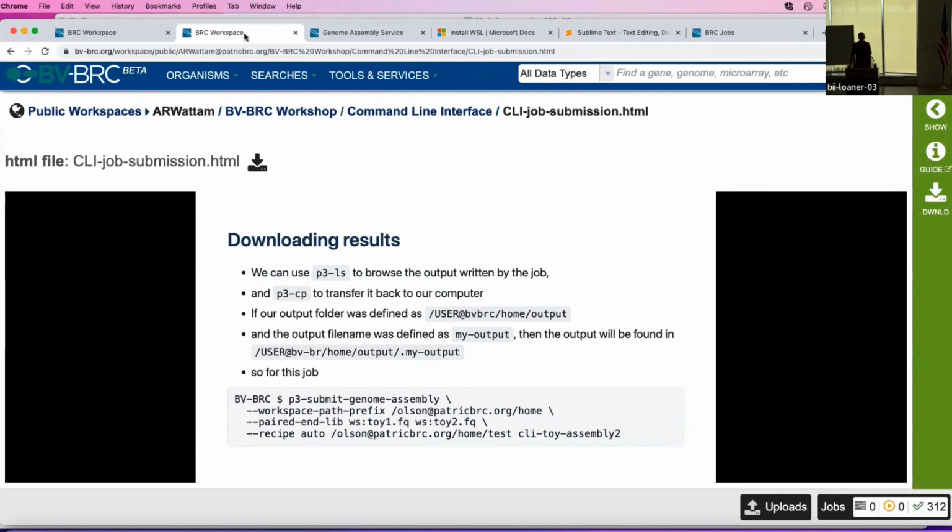To this point, this is something that people put scripts together on their own to handle. We keep talking about putting together some basic batch things, making some assumptions for you about how to do it. Maybe that can be a goal for the next workshop. But again, if you have questions about it, feel free to ask. We've done a number of these things for our own work because Jim has run tens of thousands of assemblies and annotations using the command line.